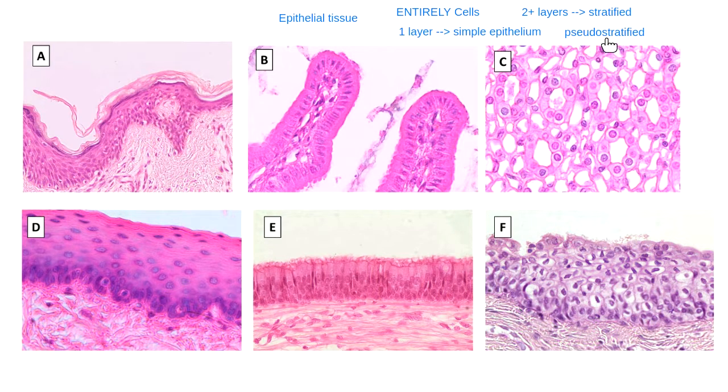Pseudostratified. This pseudo part right here means fake. Pseudostratified means fake more than one layer. This is a type of tissue that tries to make it look like there's more than one layer of cells, but there's really just one layer of cells. Everybody touches something called the basement membrane. That's basically the place where epithelial cells meet connective tissue. That's called the basement membrane. I'll give you that word over on the left. Basement membrane.